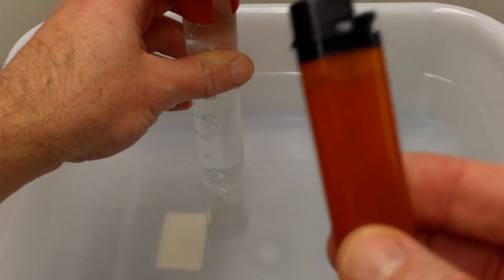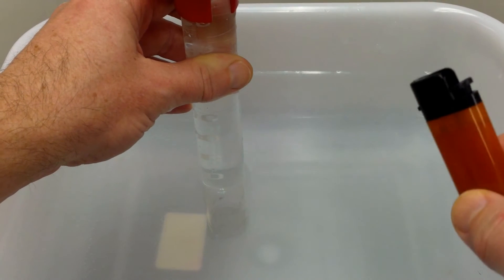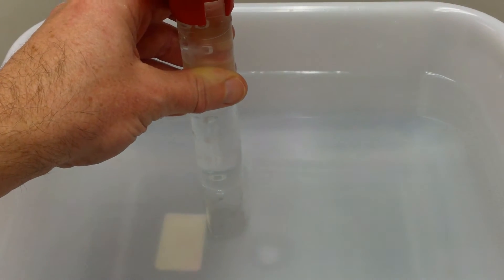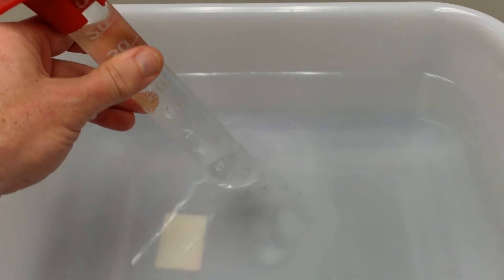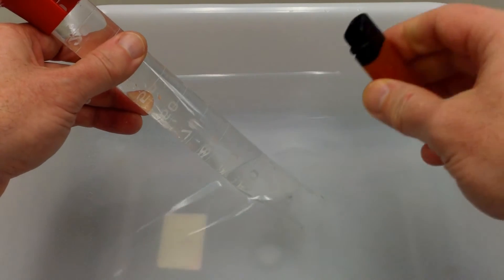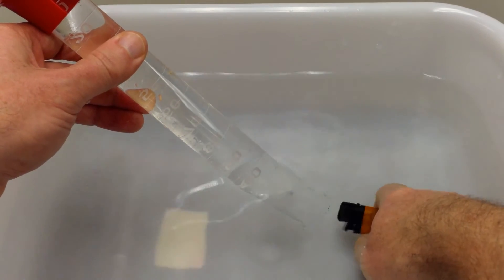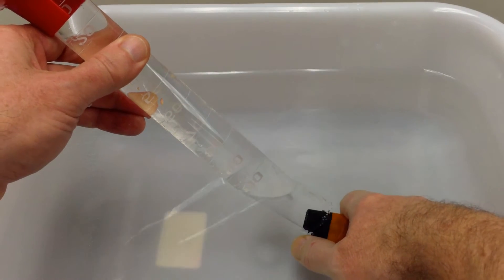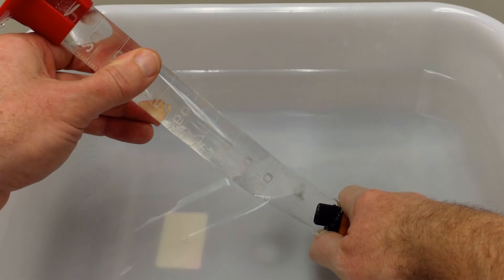The next step is to dispense butane from the lighter into the graduated cylinder — we'll do this underwater, so the dispensed gas will travel up and form an air pocket inside. We want to dispense between 95 and 100 milliliters of gas. I'll angle the graduated cylinder, keeping the open end under the surface, submerge the lighter, clear any bubbles, and then depress the plunger underwater to dispense the gas. You can see the bubbles of butane traveling up through the graduated cylinder.